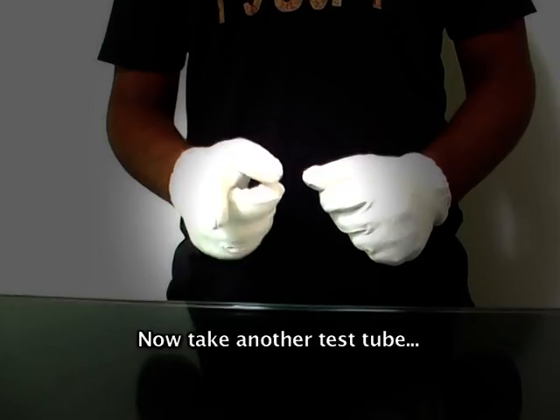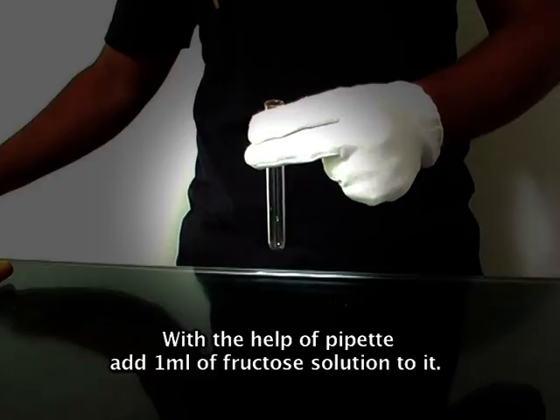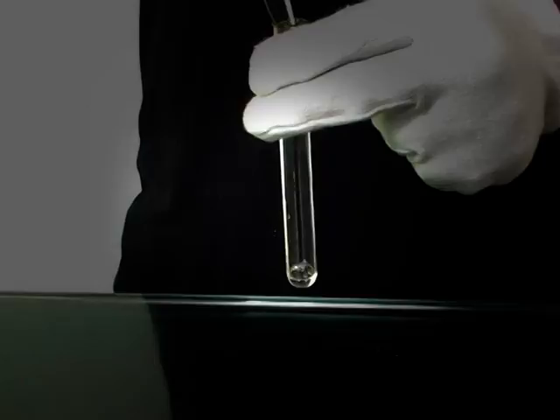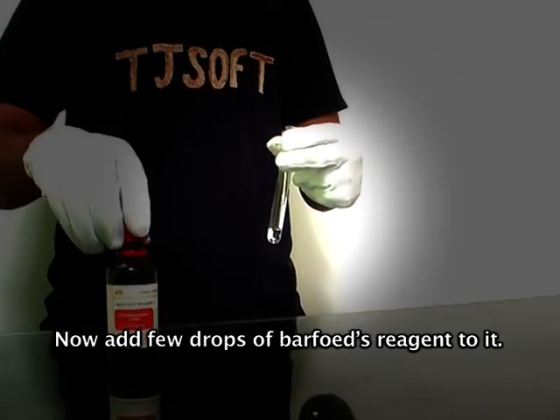We have one more experiment to confirm this again. Now take another test tube. With the help of a pipette, add 1 ml of fructose solution to it. Now add a few drops of Barfoed's reagent to it.